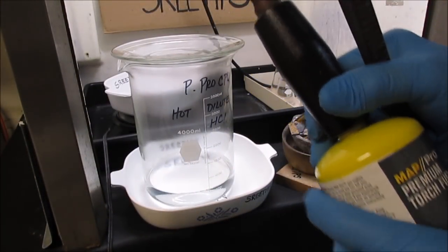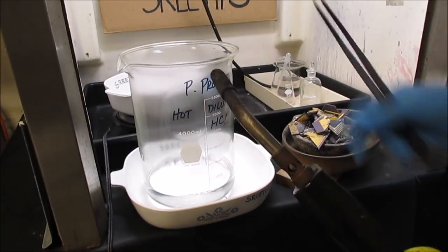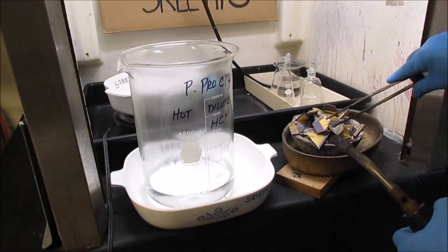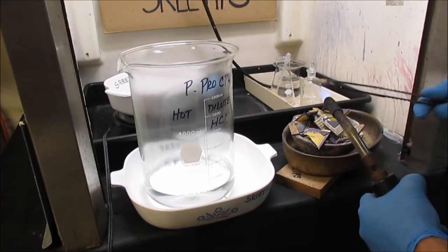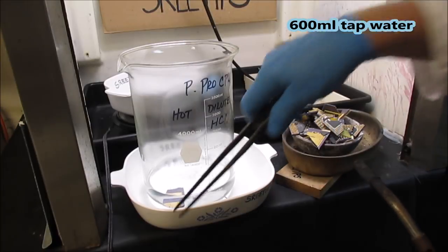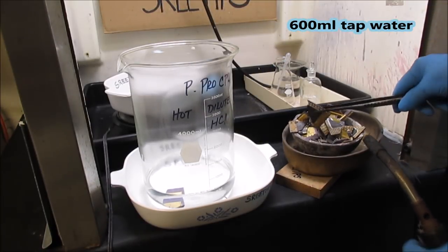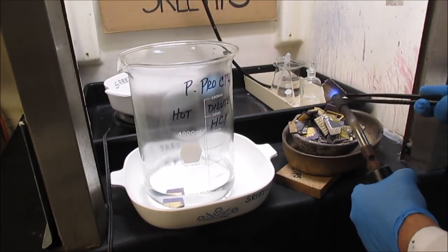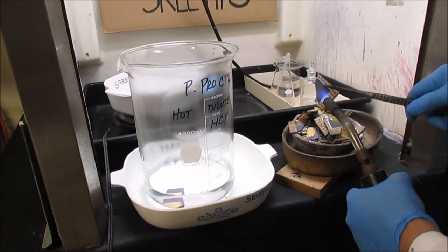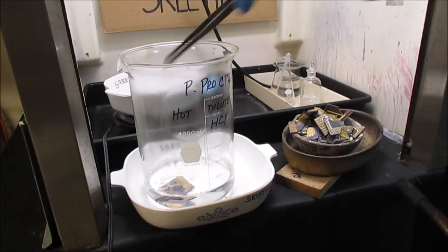What I'm going to do next is lightly incinerate these pieces. What I mean by that is I'm going to hit them with the flame until they quit smoking, and that's it. I got some tap water in here, and I just pick each piece up, hit it with the flame until it just stops smoking, burn off the grease and oils that might be on there, put it in the beaker.